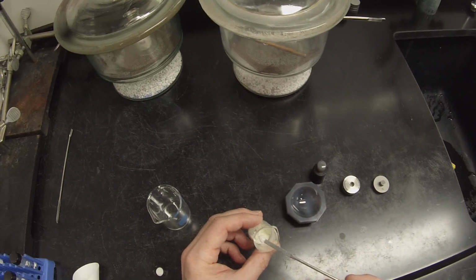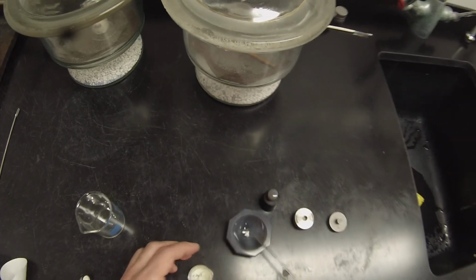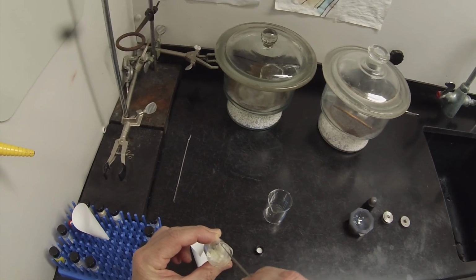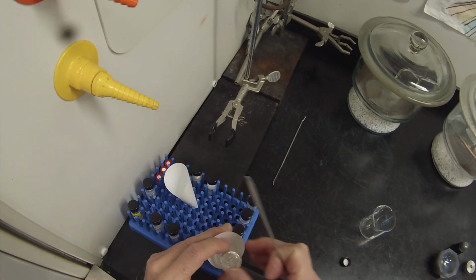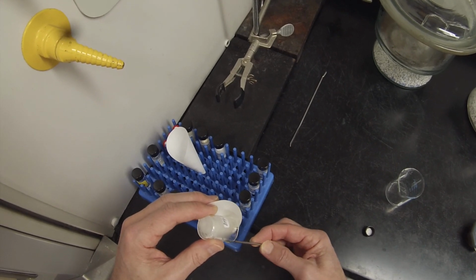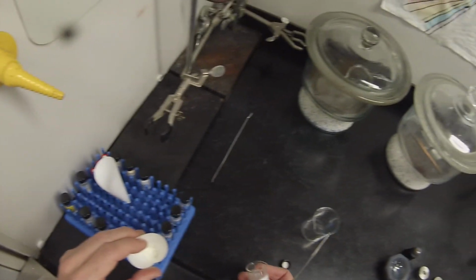Don't need much compound. This is a very low density compound too, so a little bit of compound for the IR, that's probably plenty, a couple milligrams. And we want to try to get the rest of this out of here into the vial. Sit that like that. There's a little solid left, but I got most of it out.